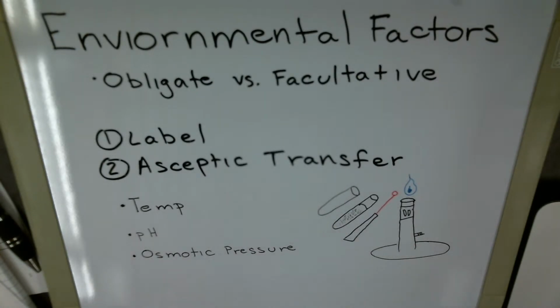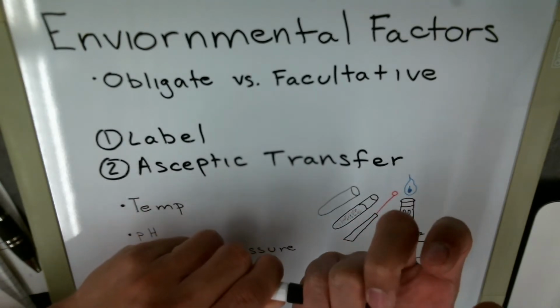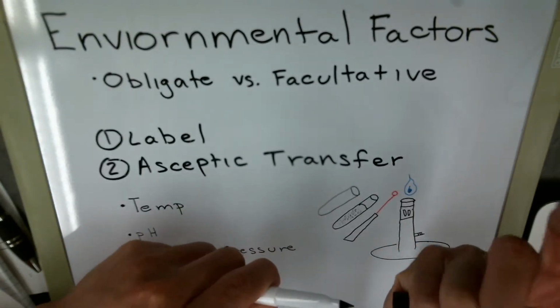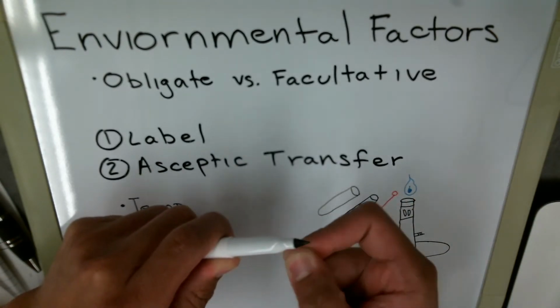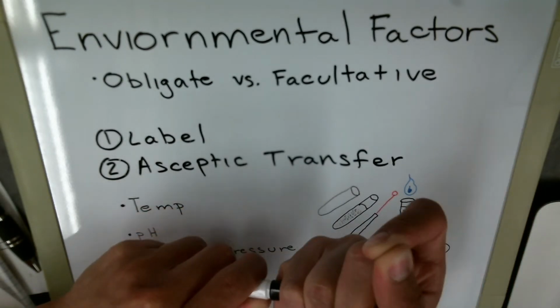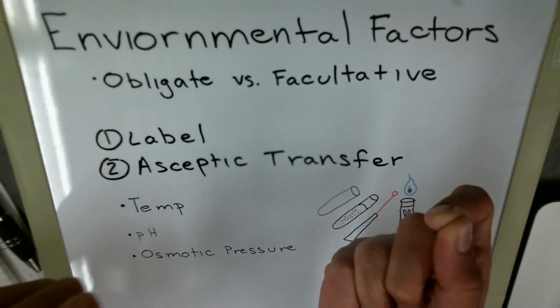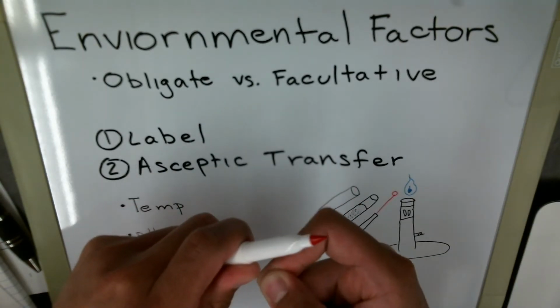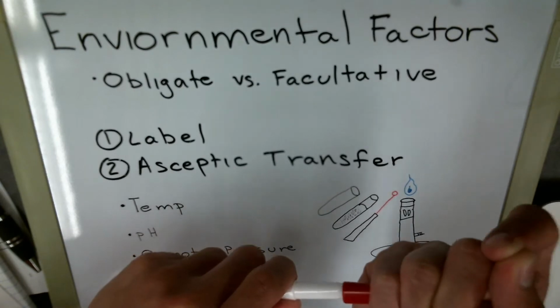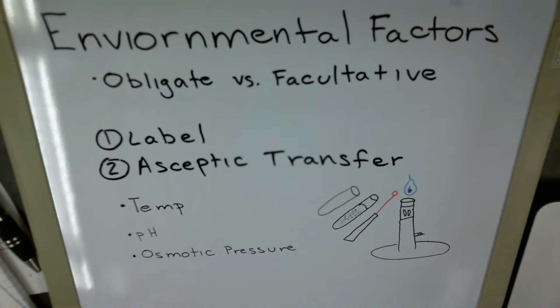And so how that works is, let's say that this is your test tube. You guys will grab the cap off with your pinky, or your pinky and your ring finger. You'll pull it off. You'll already have flamed your loop. Take the loop, take the bacteria in, recap it, put it away with the other hand, get the other test tube, take it off, flame, inoculate. Take it out, recap, and then that's that. You'll be doing that pretty much for the whole thing.